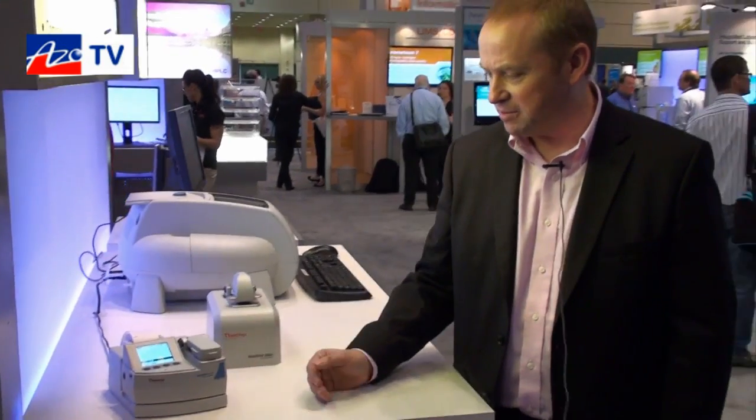So that's the latest member of the NanoDrop family, the new NanoDrop Lite. And it's suitable for what types of samples? Typically this would be used for the quantification of nucleic acids — DNA, RNA — and it can also be used for the quantification of purified proteins, very much as part of the workflow for analysing nucleic acids.